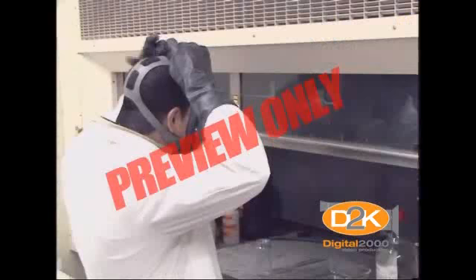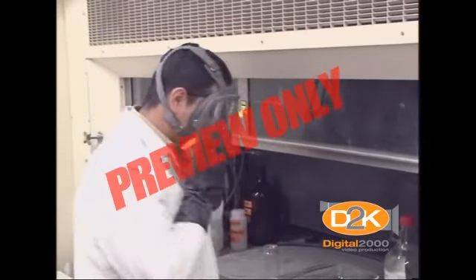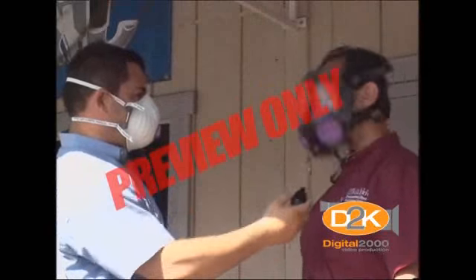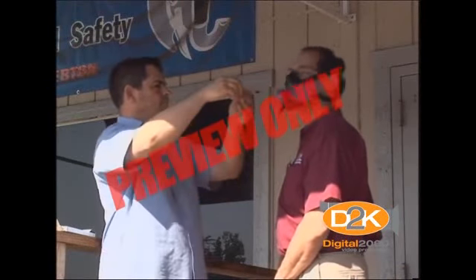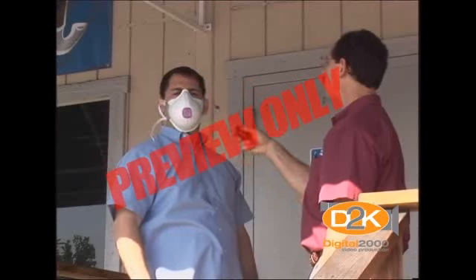Respiratory protection requirements vary depending on the type of respiratory hazard present. In general, respiratory protection should fit snugly and form a seal so that air may not leak through the sides of the respirator. Types of respiratory protection may include the use of half-face mask, full face mask, powered air purifying respirator, or a particulate mask.